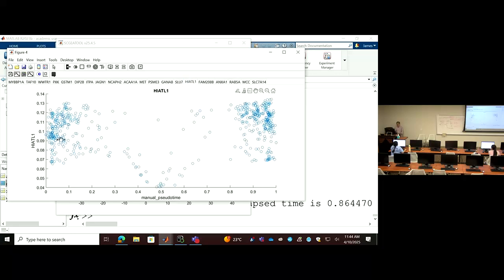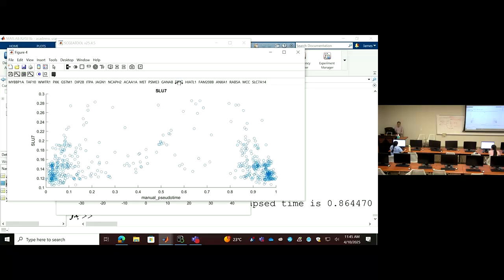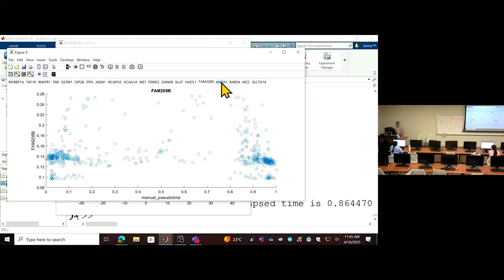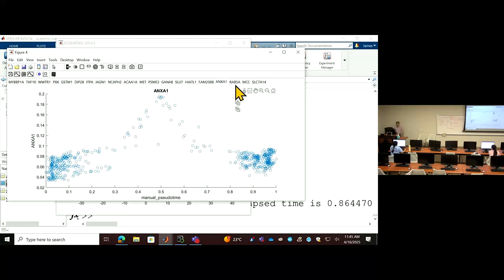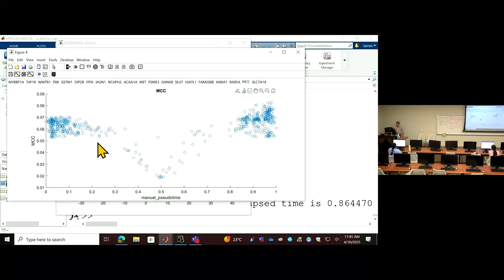Yeah, so I don't know, maybe this just means nothing, it's all artifacts, because our samples were selected or sampled from mature cells, and also weeks 8 to 14, they're too long in the middle. So maybe there's no continuous state change. So what we detect here is nothing special, just artifacts.